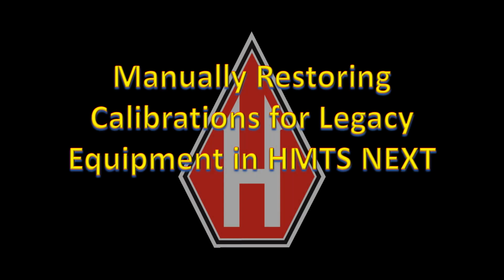This lesson covers how to rebuild calibrations for sensors installed on Humboldt legacy equipment. Sometimes mishaps or errors can cause calibrations to be lost. If this happens, they can usually be restored manually using the NEXT software, provided the original calibration information is available from calibration certificates or from other backup methods.